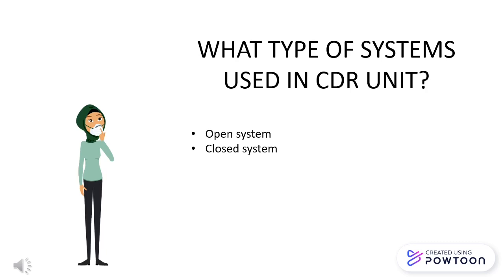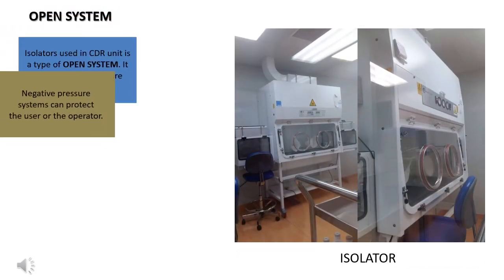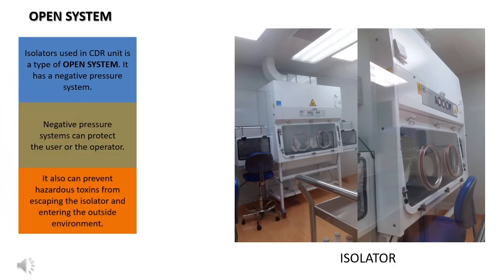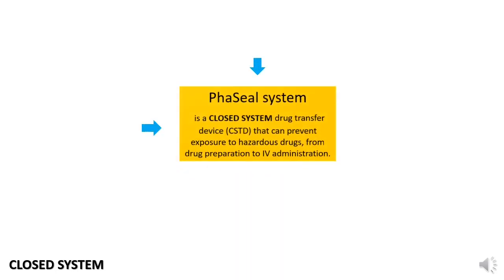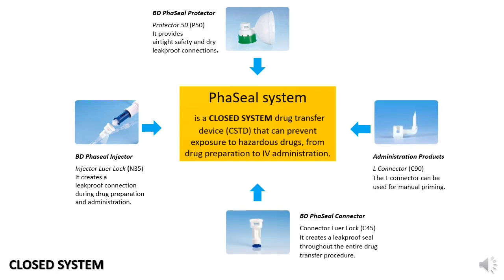What types of systems are used in the CDR unit? There are two types: open system and closed system. Isolators used in the CDR unit are a type of open system. They have a negative pressure containment system, which can protect the user or the operator because the pressure inside the isolator is less than the pressure in the clean room environment. This prevents hazardous toxins from escaping the isolator and entering the clean room or the outside environment. The closed system can prevent exposure to hazardous drugs from drug preparation to IV administration.